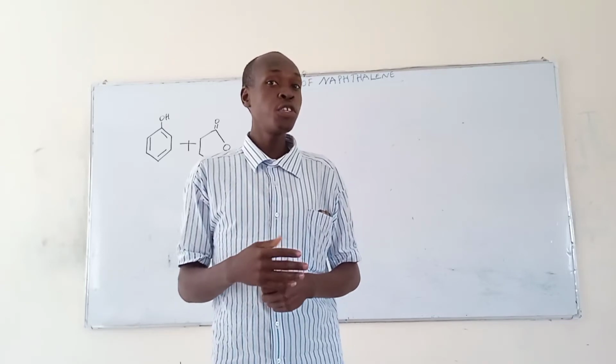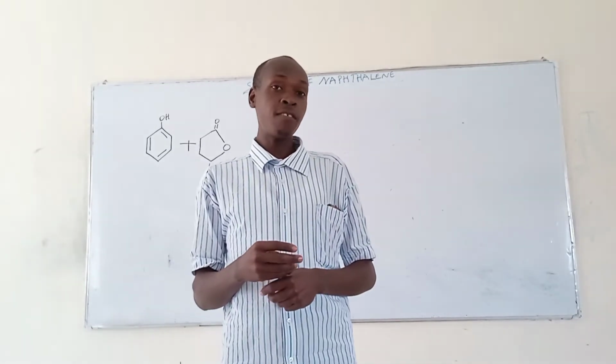In this video, we are going to look at the synthesis of naphthalene.